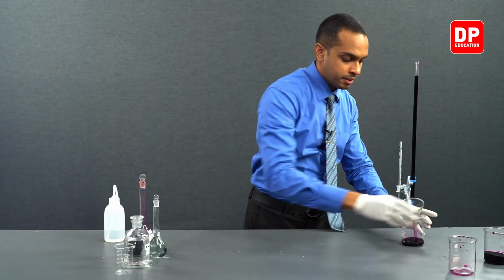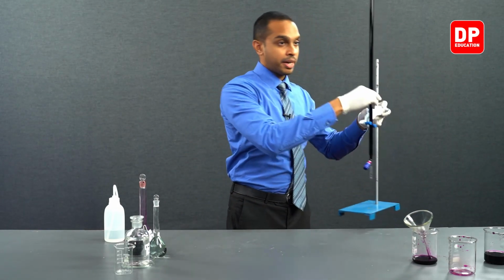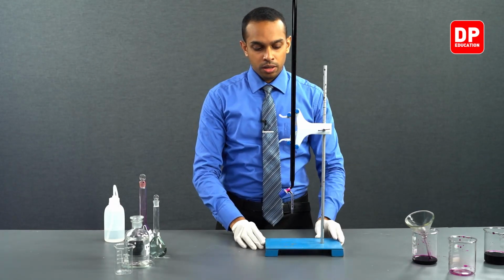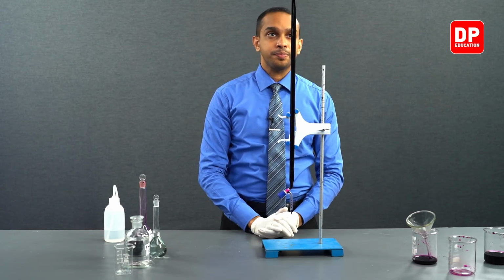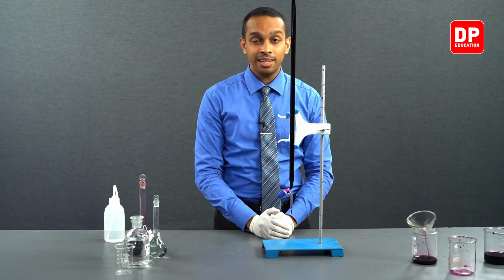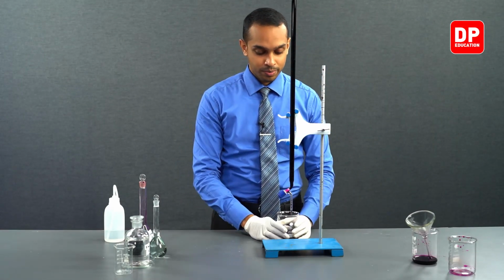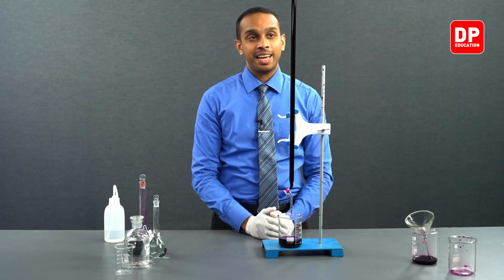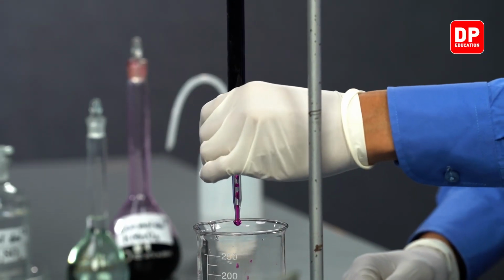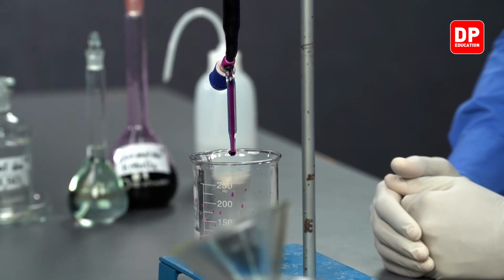After adding the potassium permanganate solution over the zero line, you can see that the tip of the burette is still empty. So we need to fill that area as well. So what we do is we open this tap rapidly to make sure that area is completely filled.